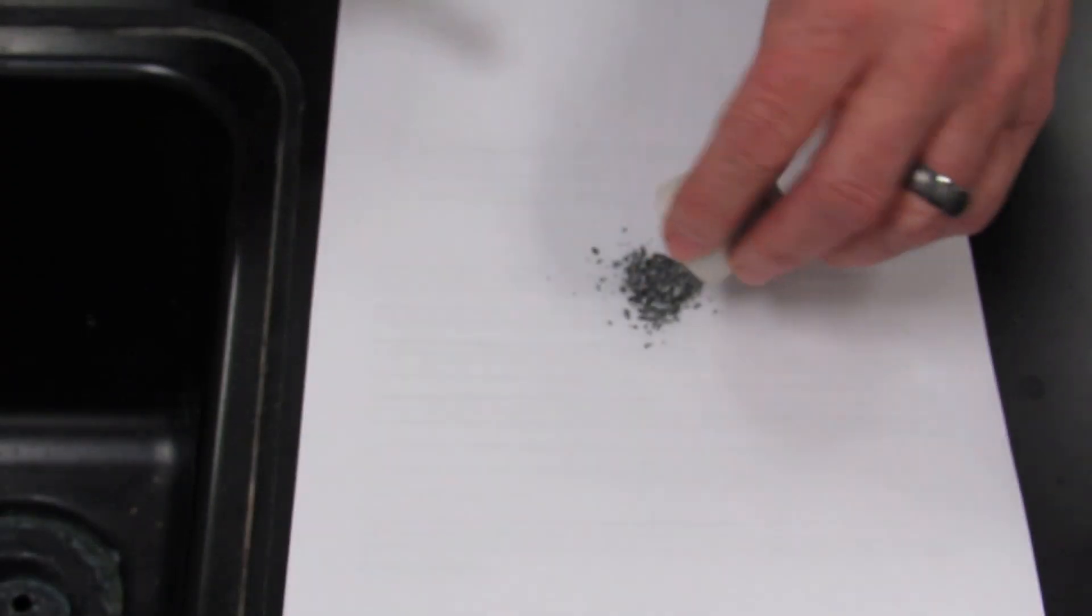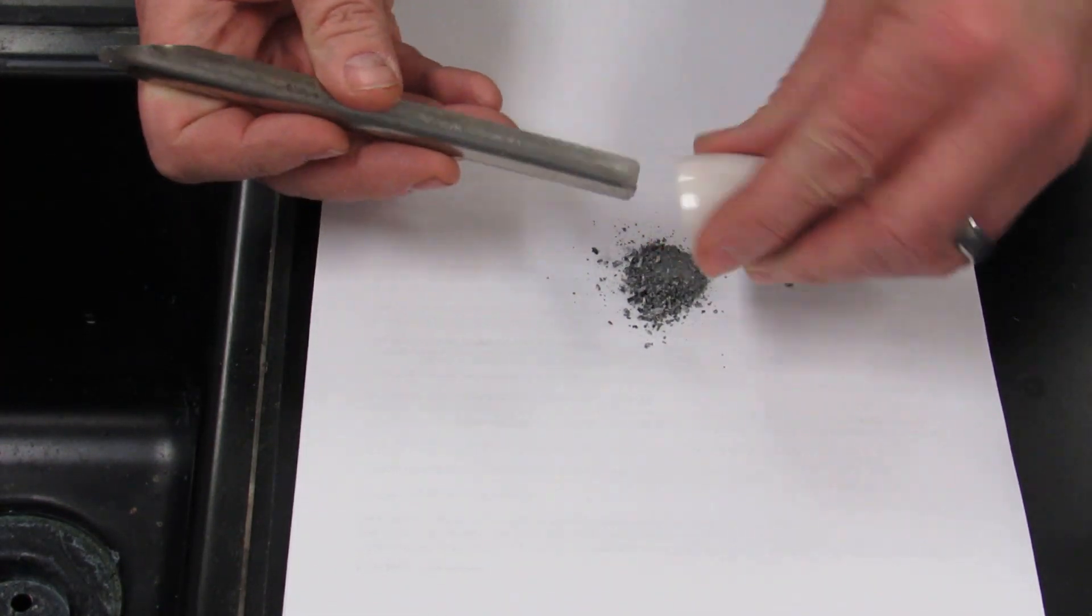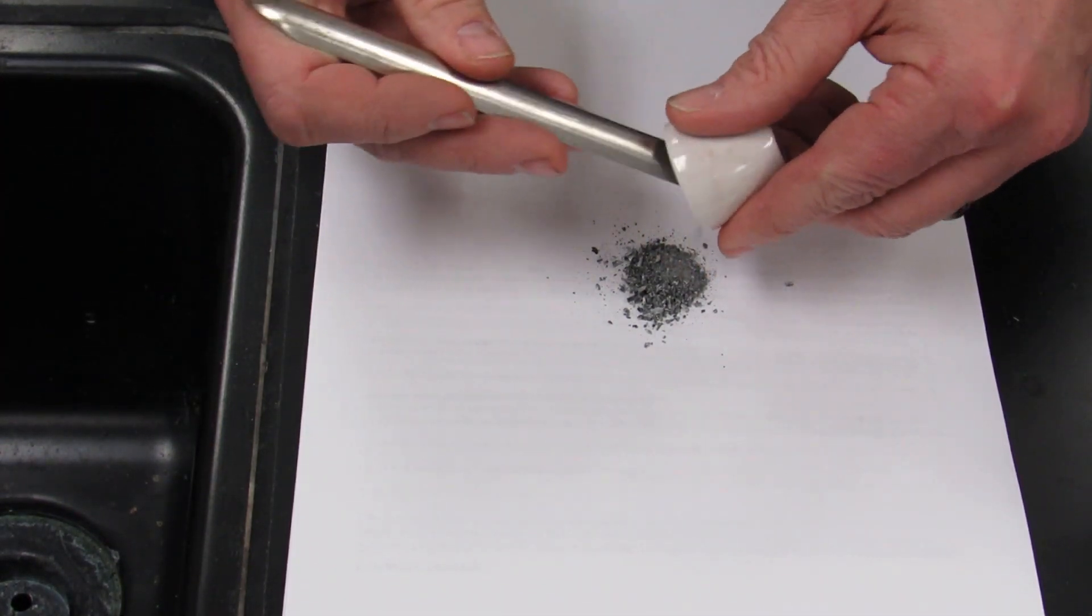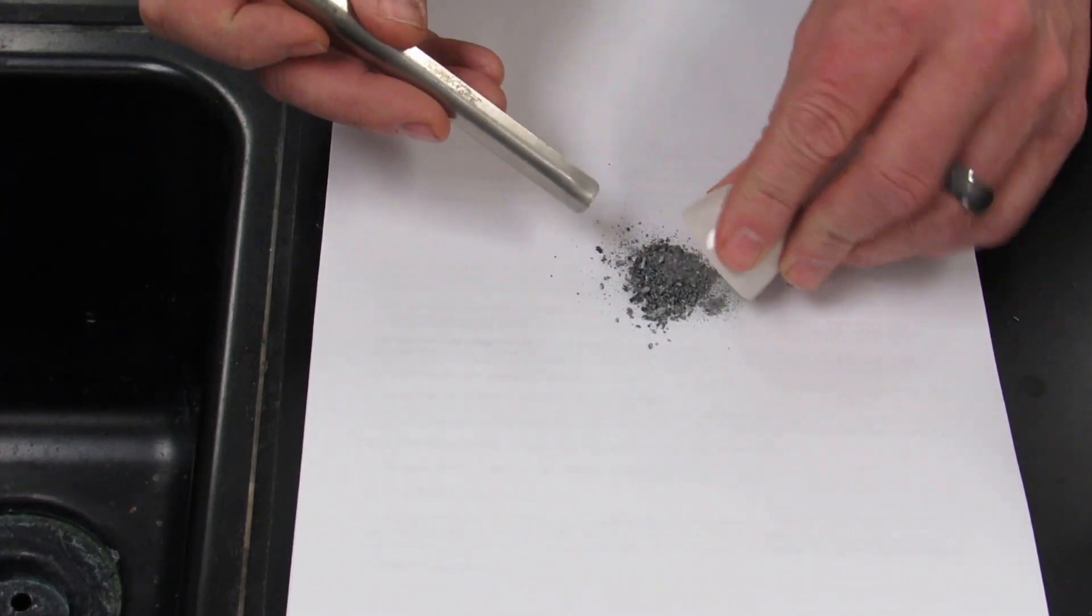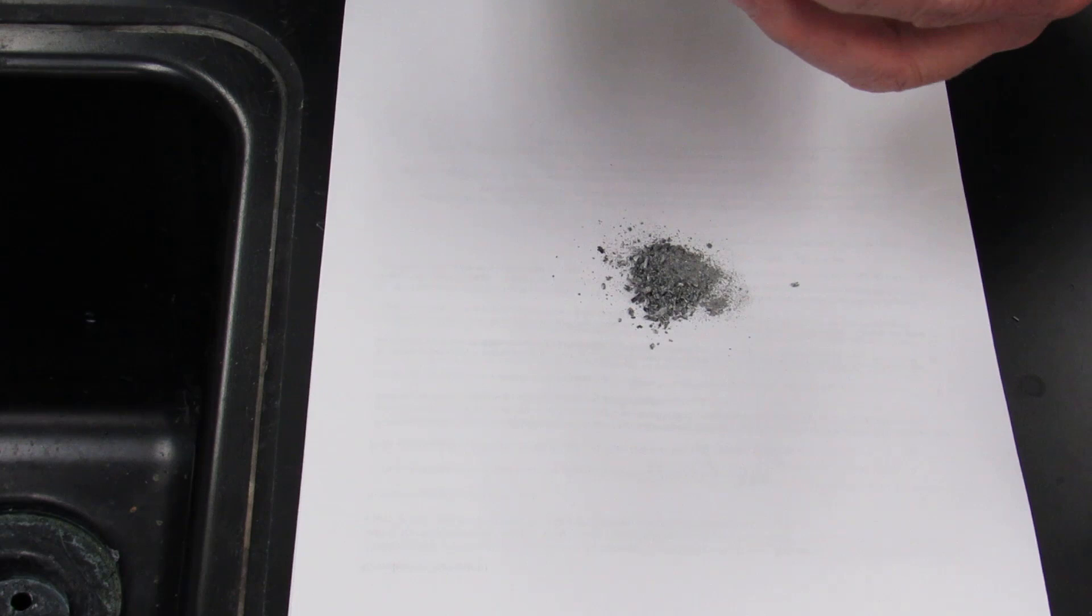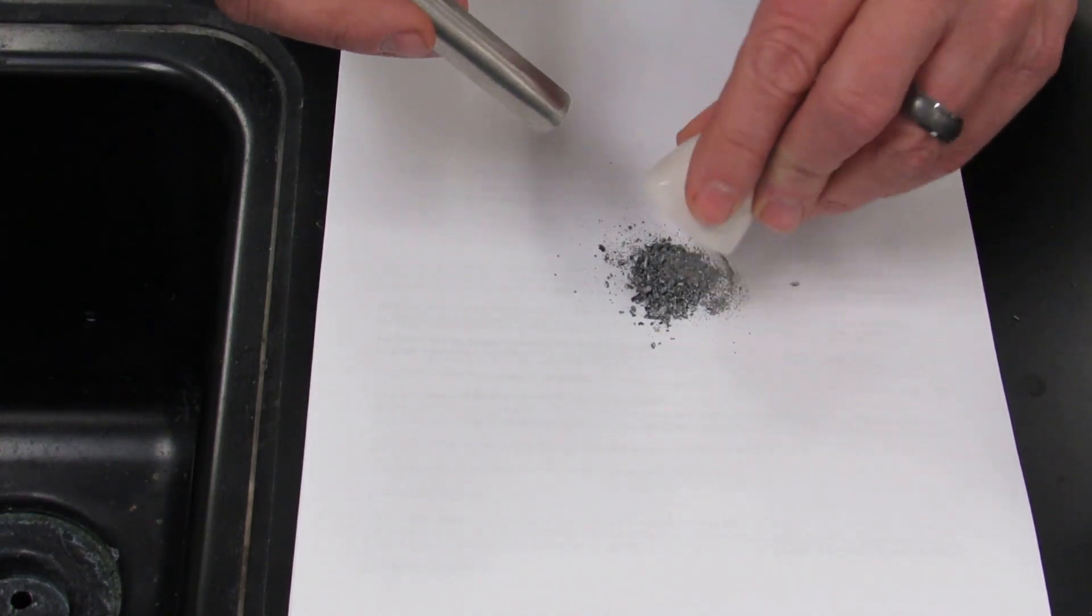Now it's time for clean up. You're going to shake out the solid out of the crucible into the trash can. I did it on a piece of paper here just to show you what it looks like. Scrape it out good with a spatula to the best of your ability. Get out as much as you can.